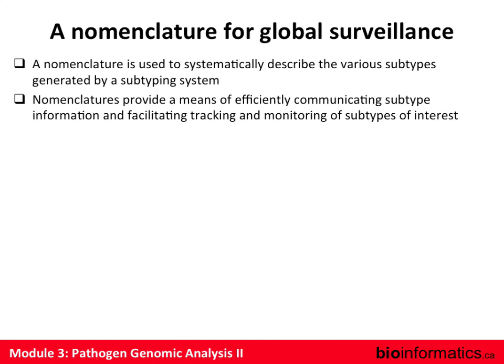If I'm in Spain and you tell me about an outbreak of ST37, I know what you mean, because we all agreed on what that means. So nomenclatures are hugely important, and that's actually one of the big reasons that MLST has become as popular as it has, and why a lot of people have hope that it is a workable solution for global epidemiological tracking and surveillance.